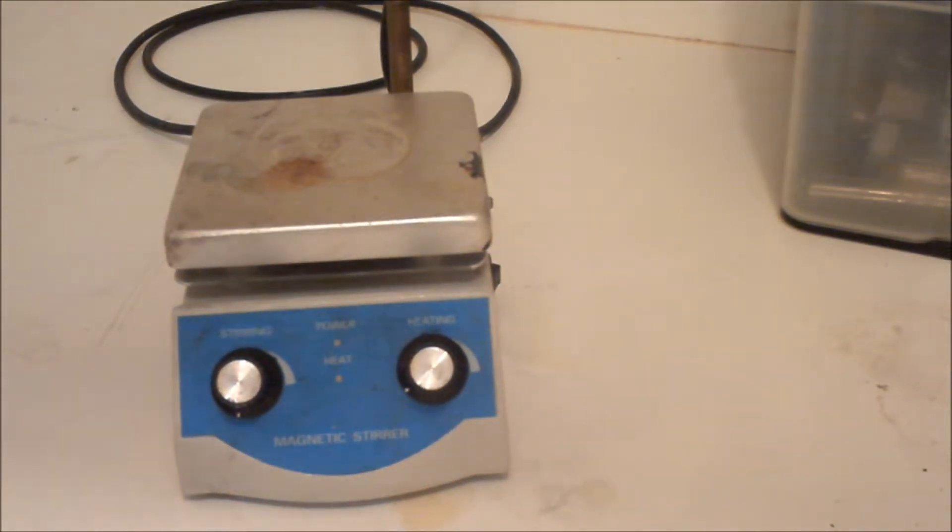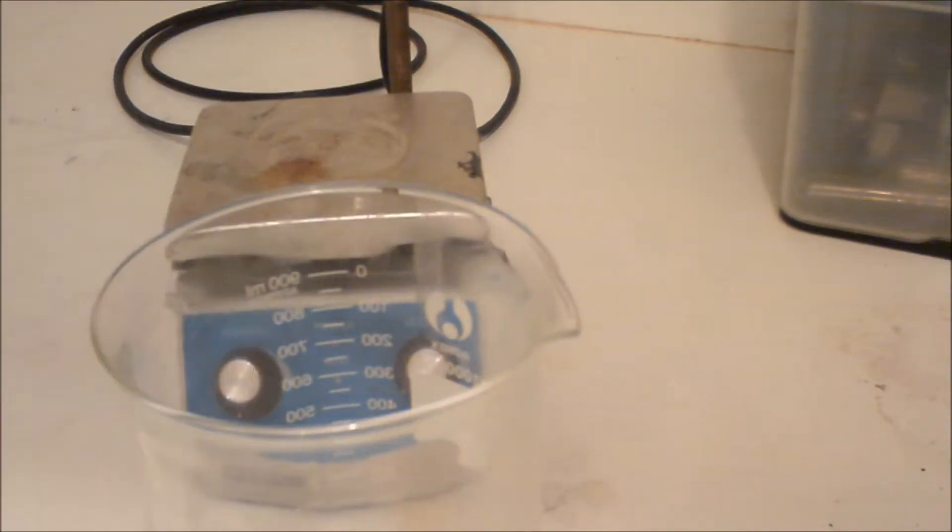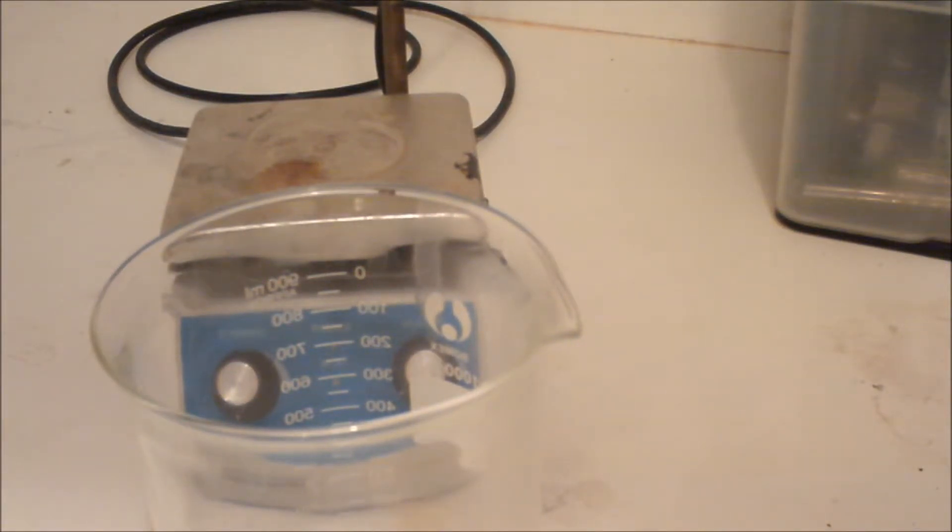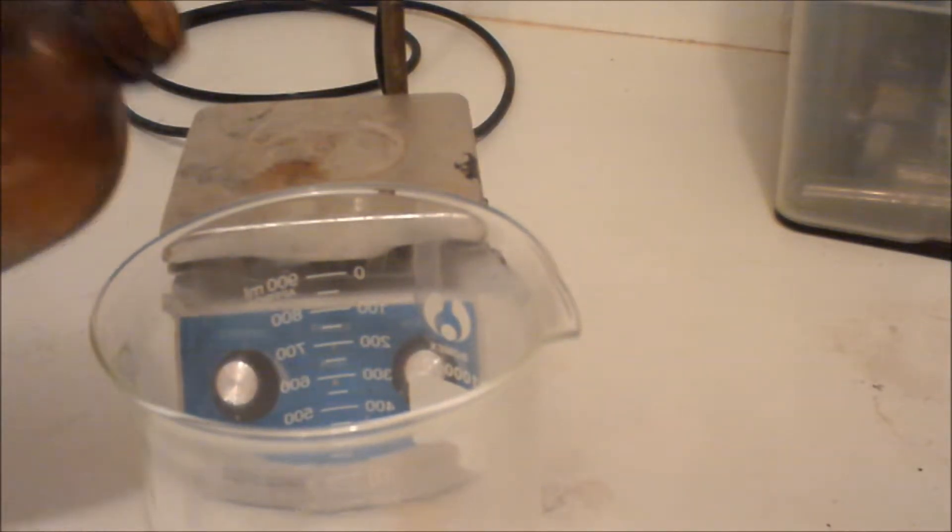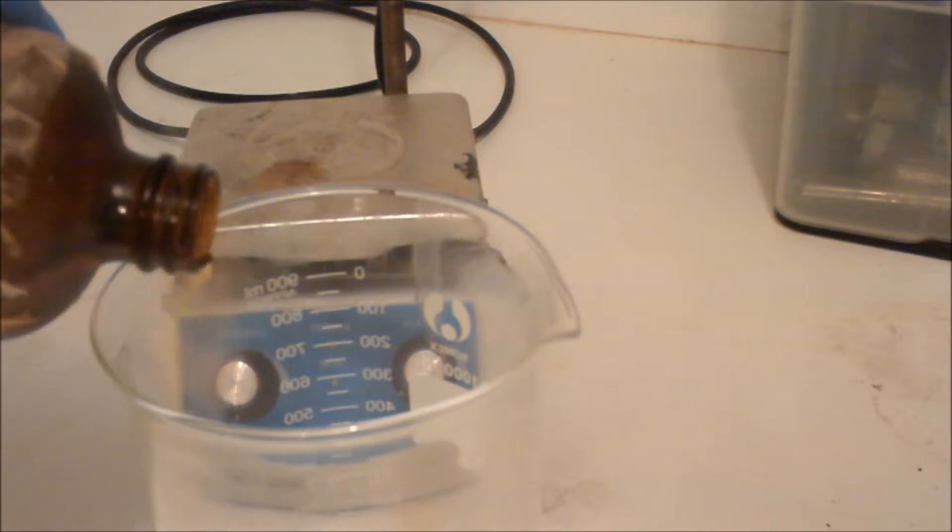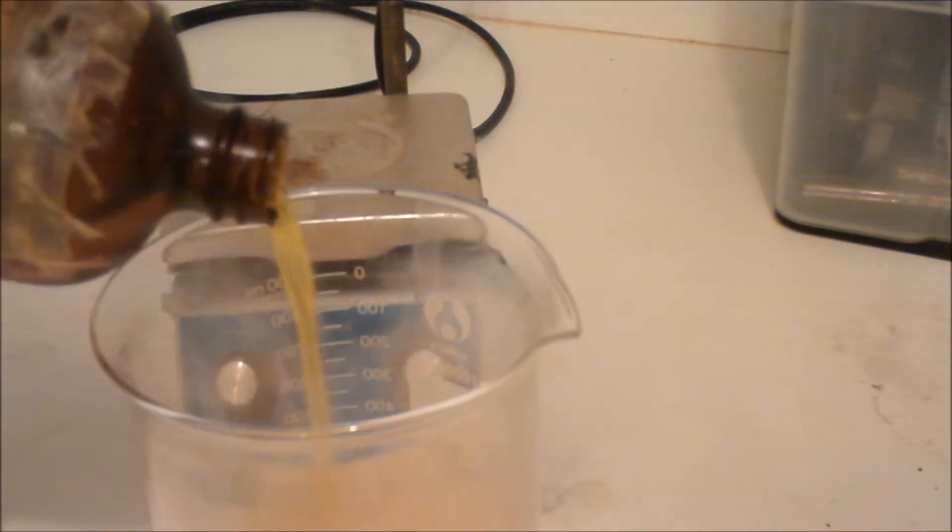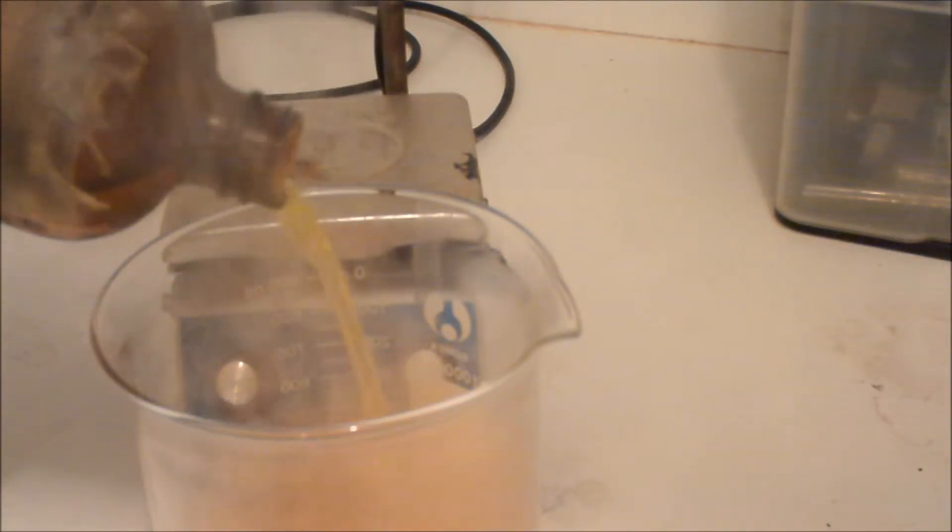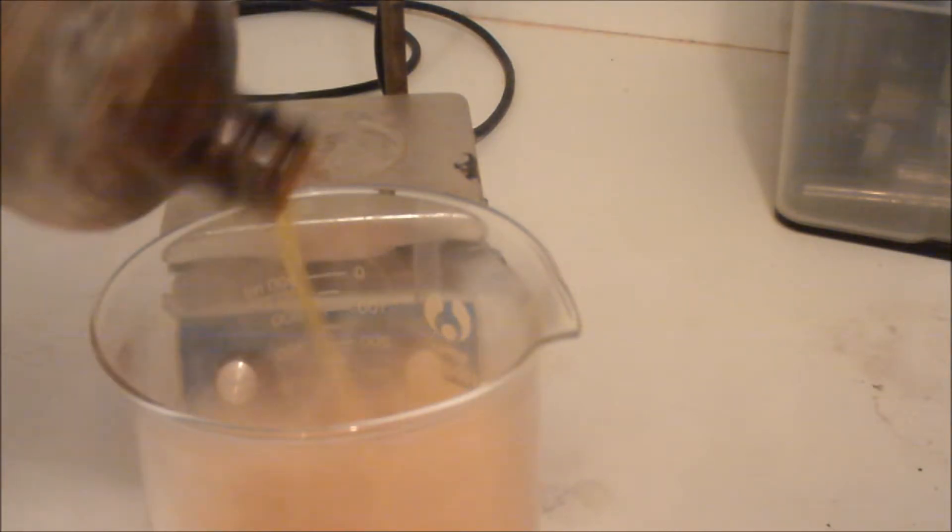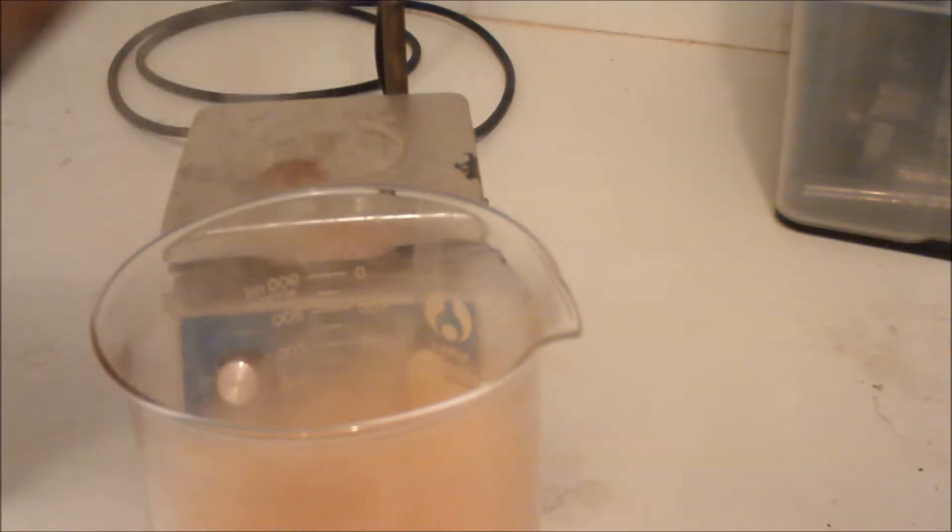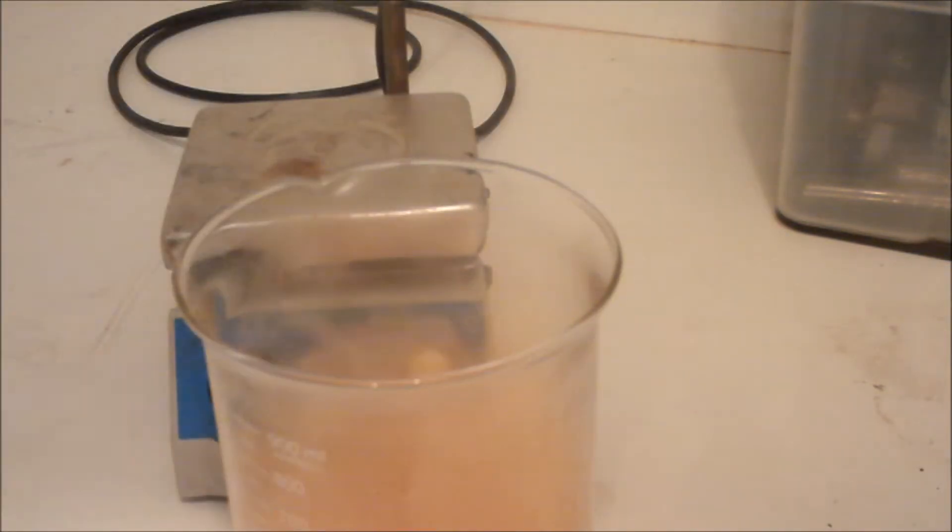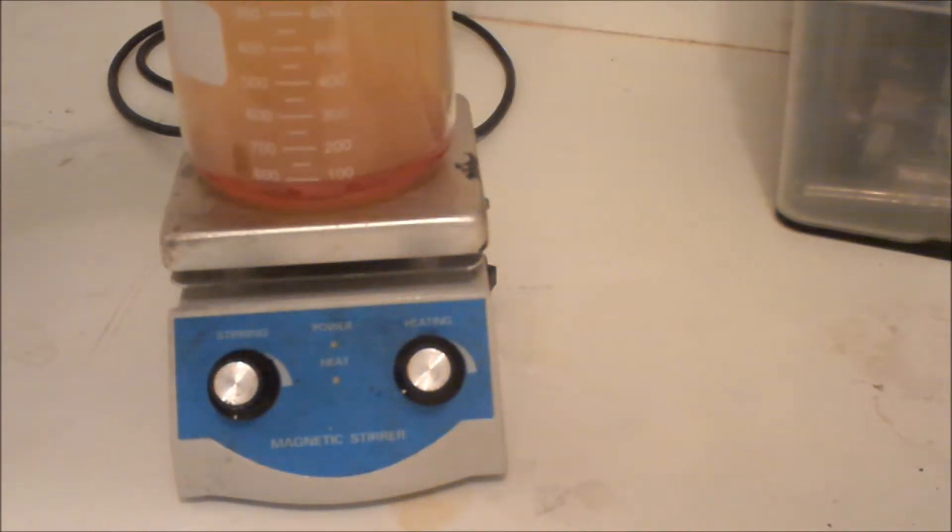I'm going to take some nitric acid and pour it into the beaker. I'm going to turn on my fume hood. I probably need to get about 100 milliliters of nitric acid in there. This is concentrated fuming nitric acid, as you can probably tell.